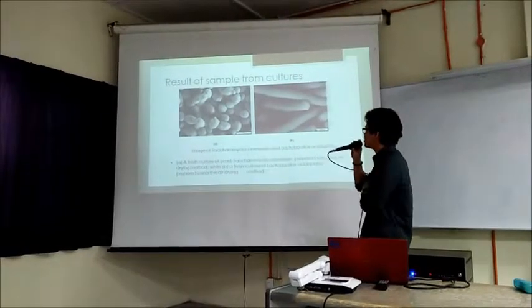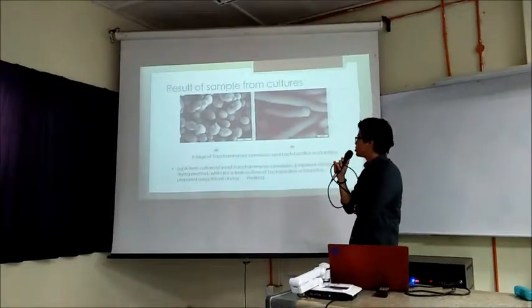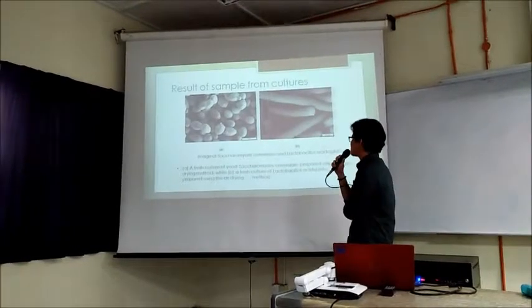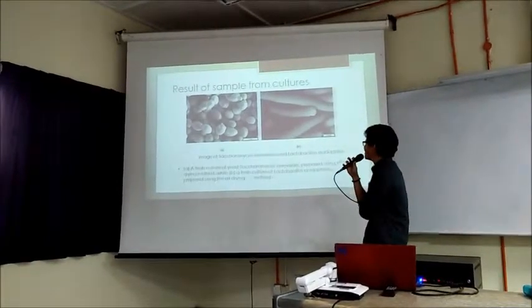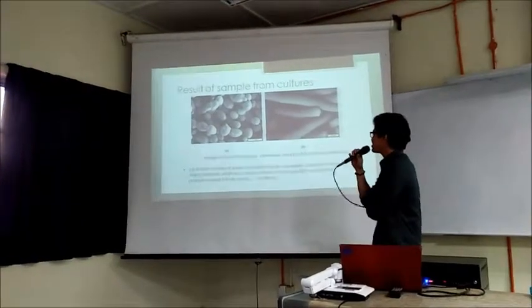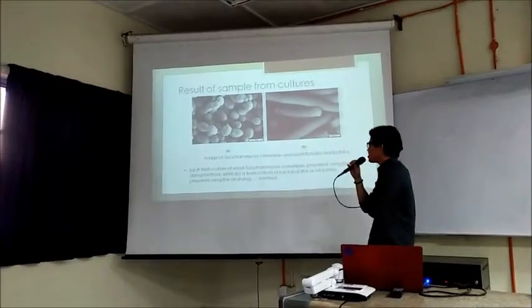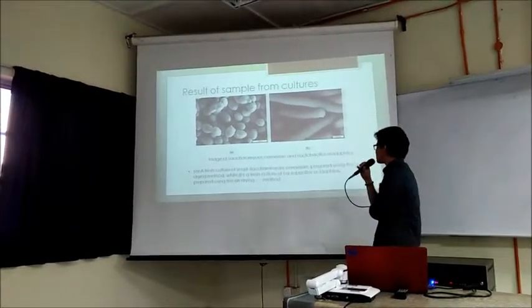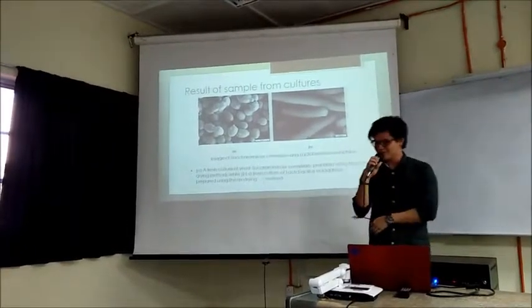Next, this is the result of sample cultures produced by scanning electron microscope. The left, which is A, is the image of Saccharomyces cerevisiae, and B is Lactobacillus acidophilus. So A is a fresh culture of yeast, Saccharomyces cerevisiae, prepared using the air drying method, while B is a fresh culture of Lactobacillus acidophilus, prepared using the air drying method. So that's all from me.